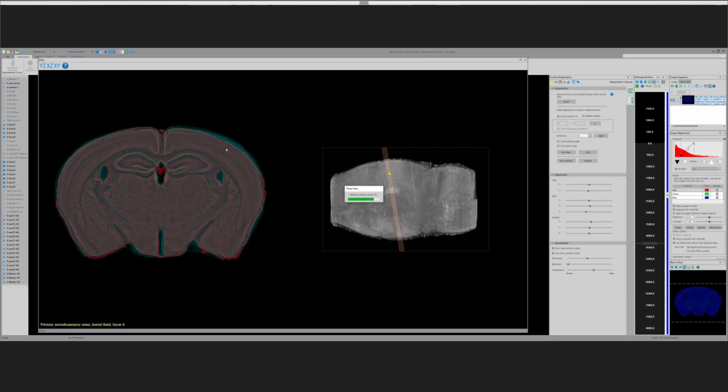And Chip, when this finishes, I'd like to ask if you could take a look at some of the regions and show how we can draw contours around the regions in the brain, and look at the anatomic structures that are mapped in the Allen atlas. Okay, watch. All of a sudden, it's about to finish. Okay, so you saw when it finished, the edge of the cortex snapped together. This is the effect of the nonlinear registration. And thanks, Brian, for reminding me what I always forget.